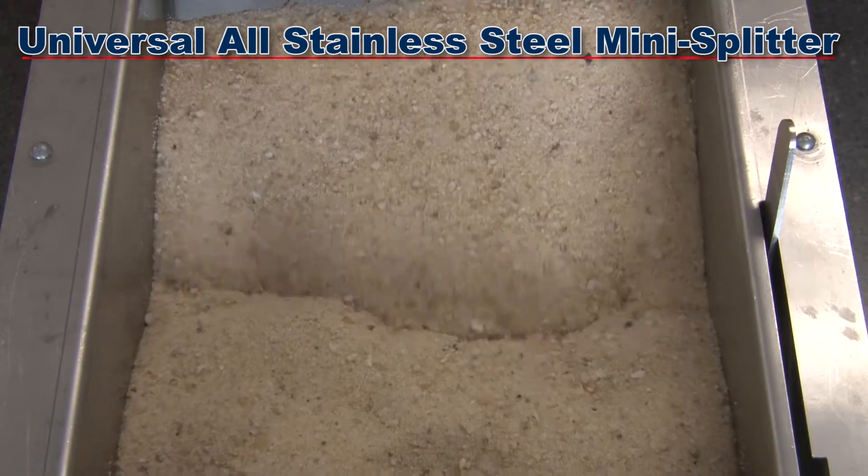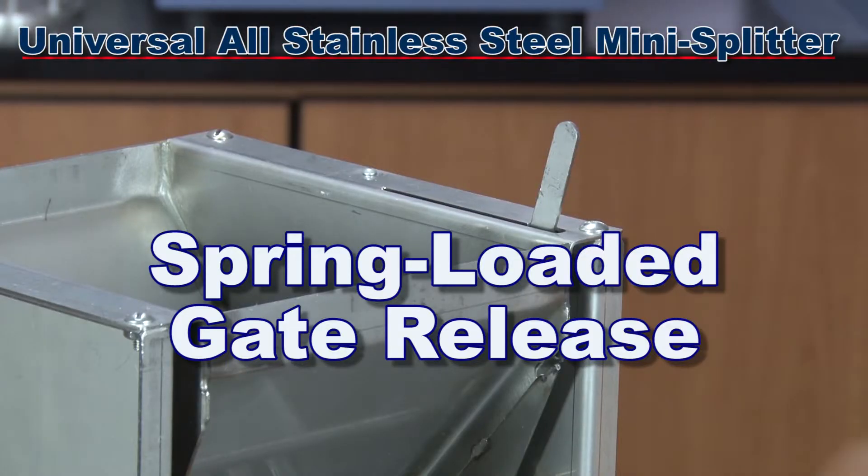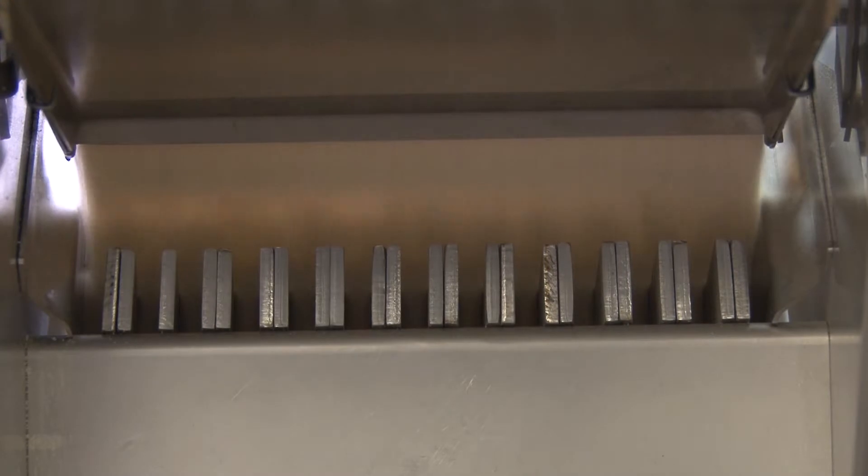The SB33's 1.7 liter capacity hopper has a spring-loaded gate release to make loading the bulk sample easy and allowing released material to flow more evenly through the chutes.